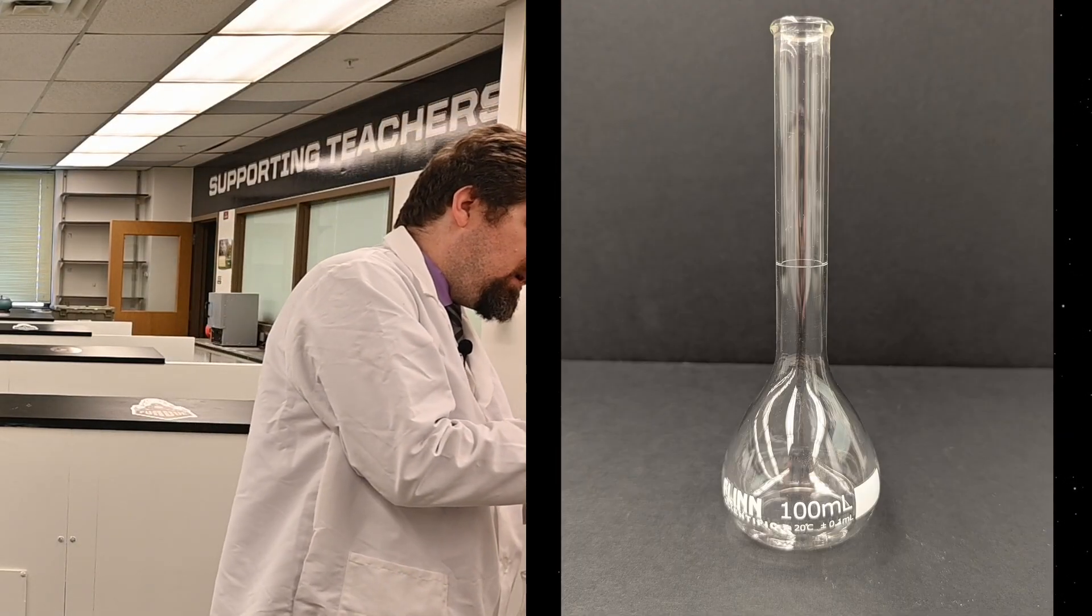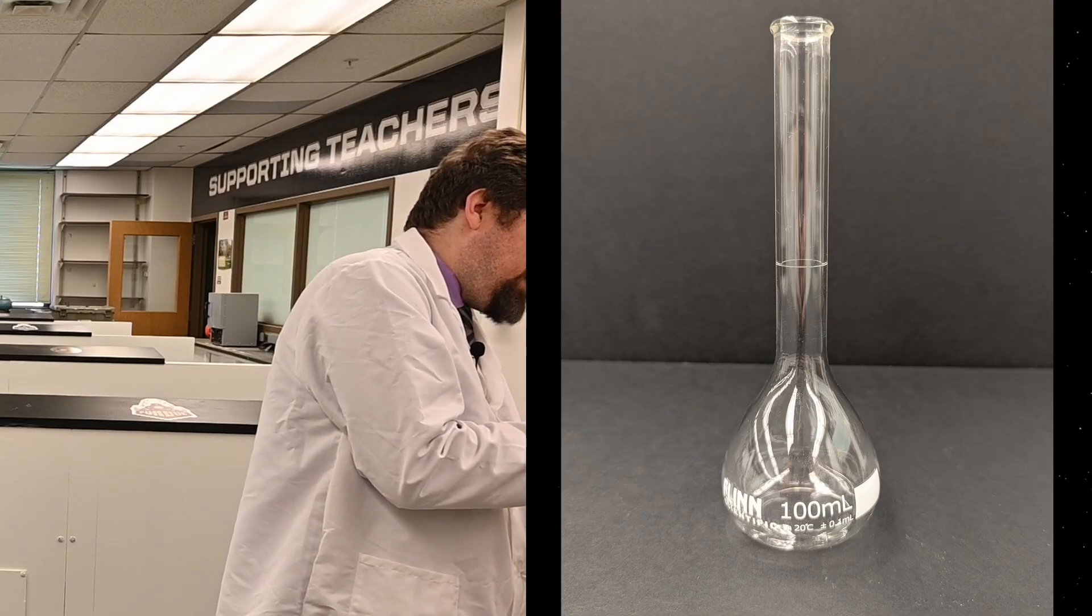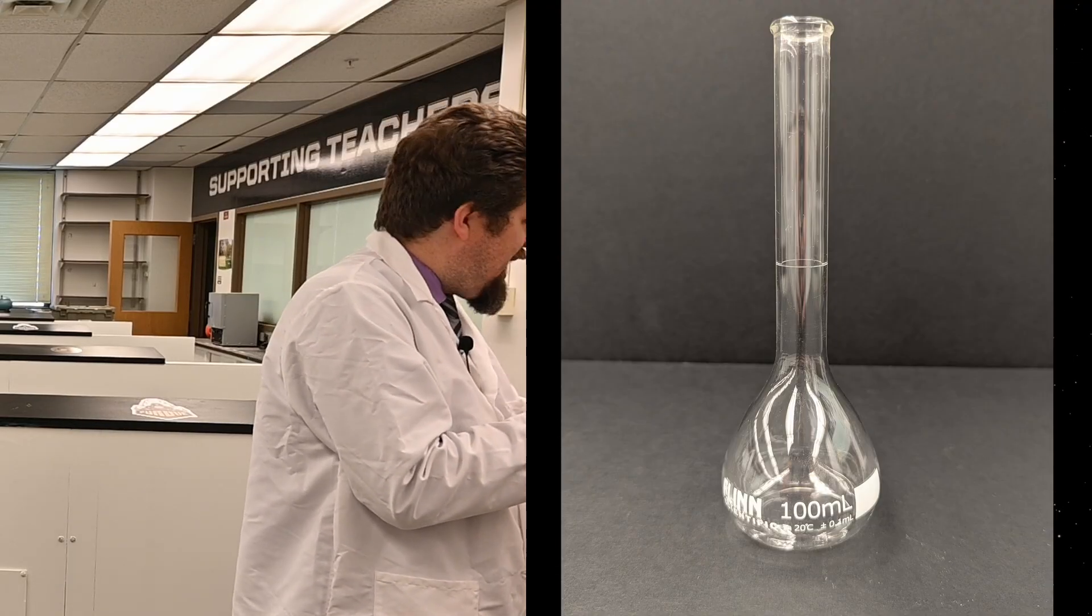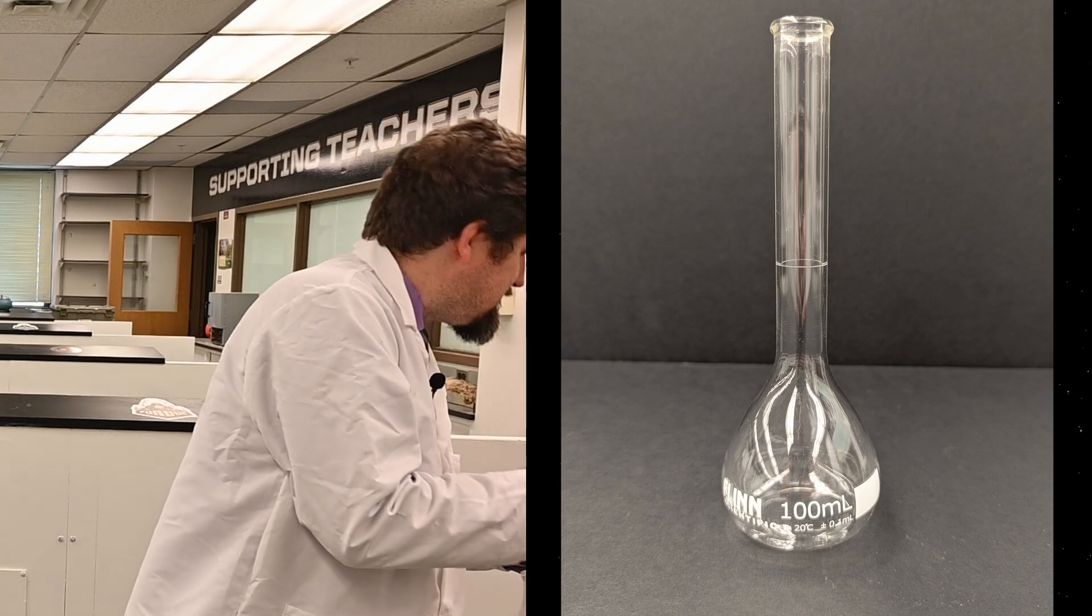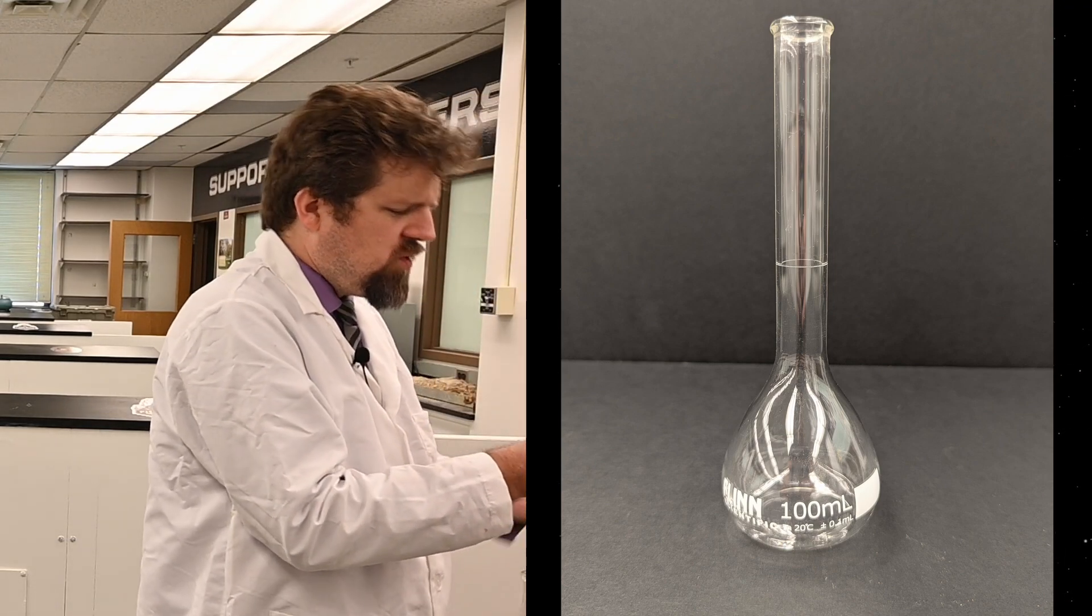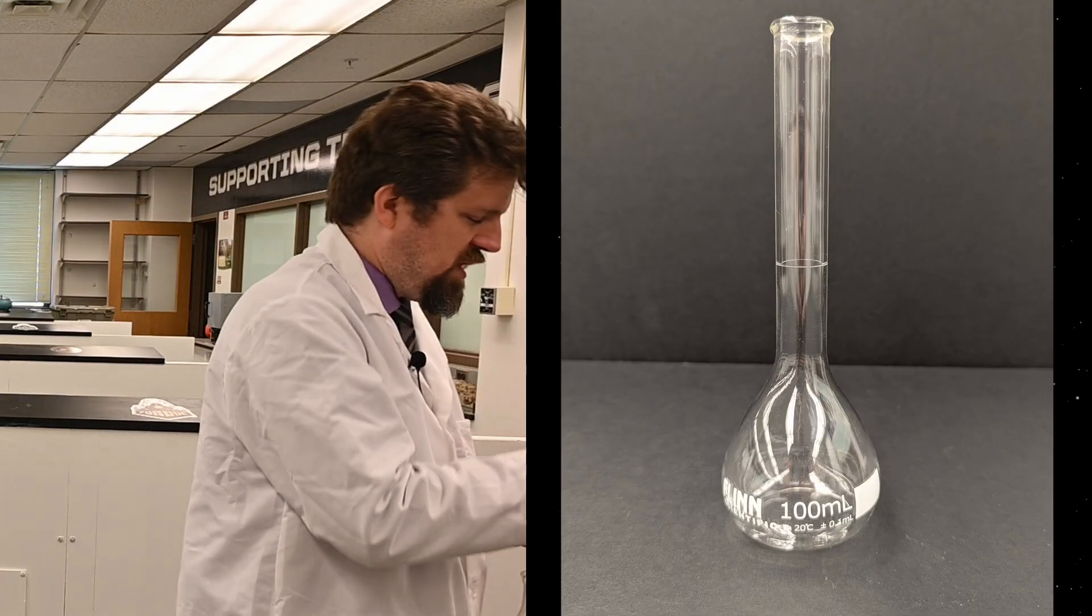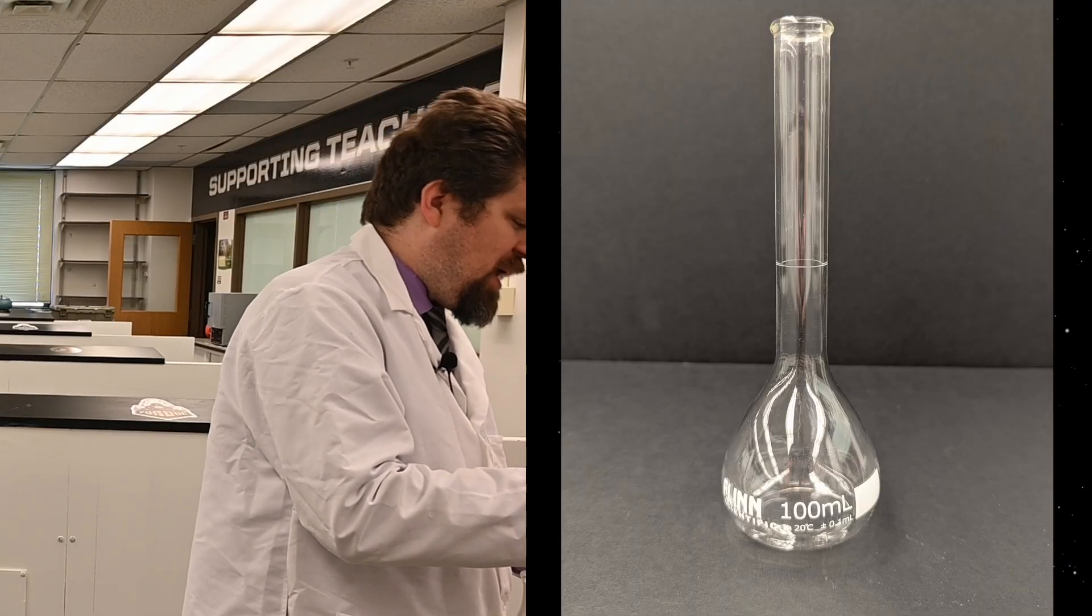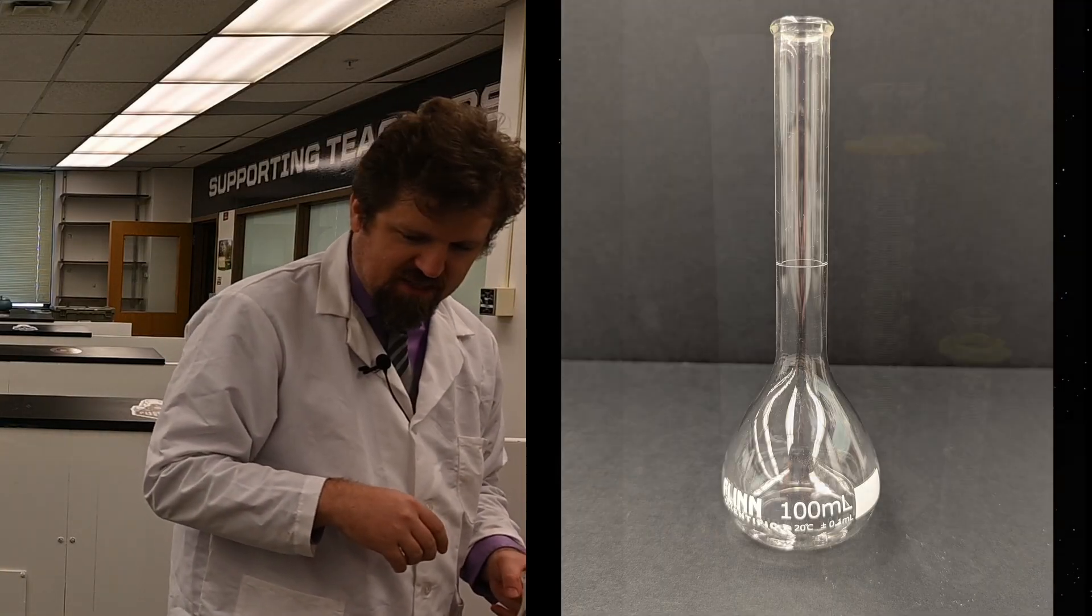If you look closely, I hope you can see it on the camera, but there is actually a tiny little faint line there, and that is a very important line. That line measures one, and exactly one value, very precisely, in this case is 100 mils. So you'll think, what would be the use of a piece of glassware that can only measure one volume? Well, if you take advanced chemistry, maybe AP chemistry, maybe even in Chem 1, you might start to talk about what these are used for.